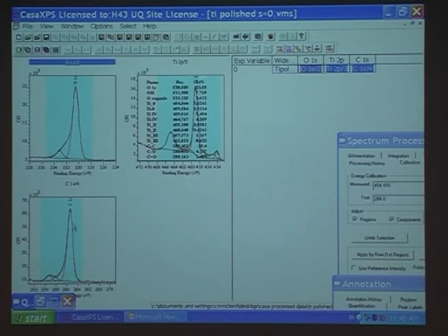And this again has interfered with things a bit. But it's good to have. I've again used 284.8, did I? No, this one hasn't been shifted at all. I didn't bother shifting this. And I've got this one at 459. It should be at 458.6. So I think using 285 would have been better for this carbon on this metal. That's just my impression. So the carbon on the metal with some oxide has a slightly different value to the carbon on the nice, clean titanium dioxide powder.